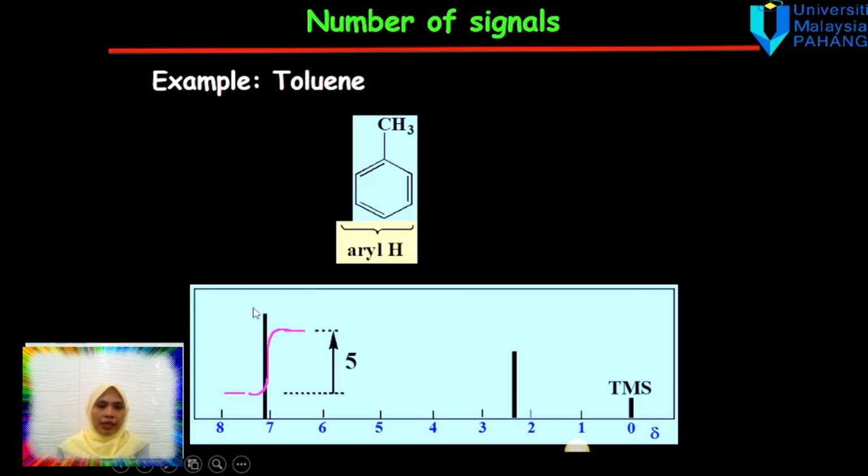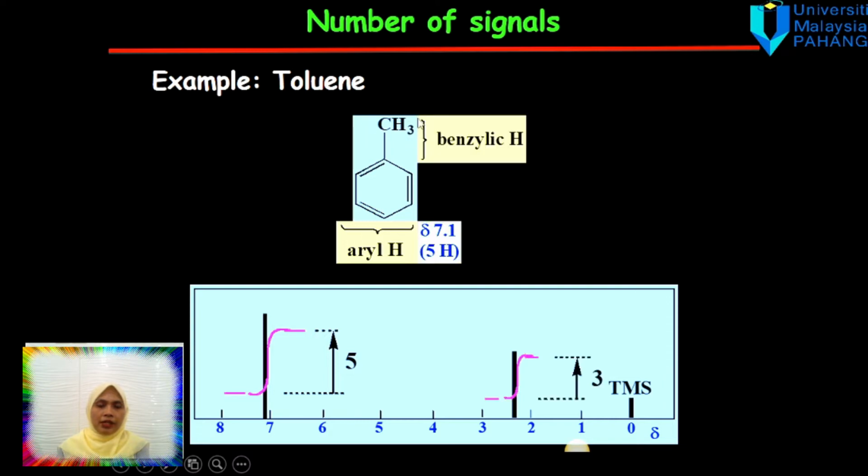Going to the chemical shift in the downfield. We see that the CH3 has saturated protons, and this one appears upfield in the chemical shift, with an integration of 3. Integration shows us the number of protons present in the molecule.